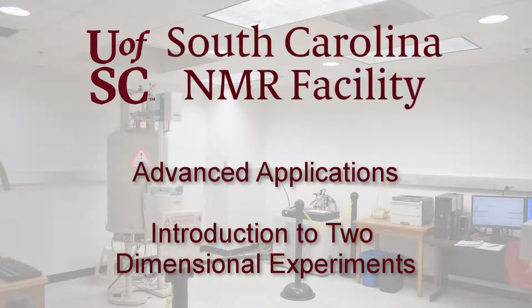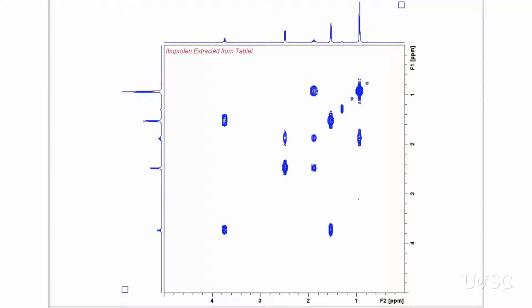As the name implies, two-dimensional NMR experiments produce results that have two separate frequency, or chemical shift axes. This video is meant to give a general description of how these experiments work and how to use Topspin to display and manipulate datasets. To get a better understanding of these techniques, we first need to present some concepts of the simple one-dimensional experiment and how it can be manipulated into giving 2D results.